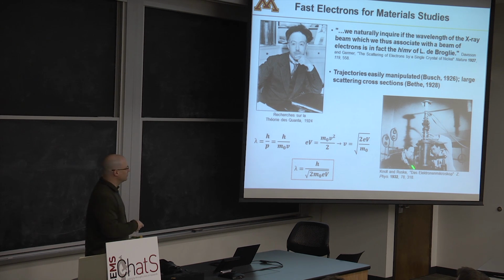So a side note, it turns out that this first microscope, this is what this is, the voltage source is here, and so there's a specimen position here, and so on and so forth. It was pretty bad, and in fact, optical microscopes were better. So it was awful. This thing was just really, really bad. A few years later, they started doing much better. So there was a big, big disconnect, right? They were so hoping they could see like the nucleus of an atom and so on and so forth. I mean, you probably couldn't even see your finger if you tried to take a look at it.